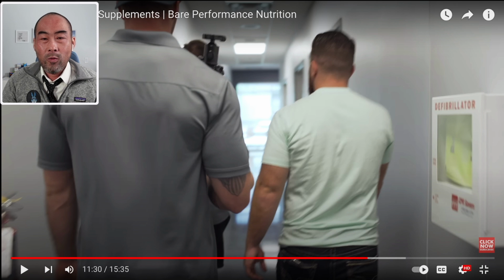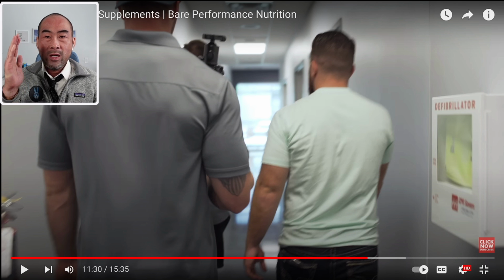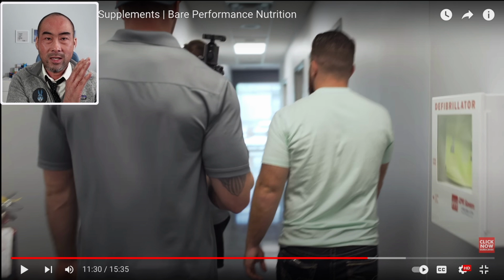And let's just be real. When there is an issue, let's just say you're testing throughout, and maybe the test method was fine, maybe it's not sensitive enough. So it's getting through the process, right? It's getting downstream. And then all of a sudden, boom, the very last thing you find, there's an issue. There's a failure. And now you have to work your way back up and figure out where the failure happened.